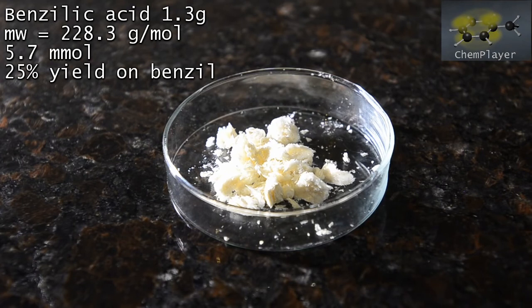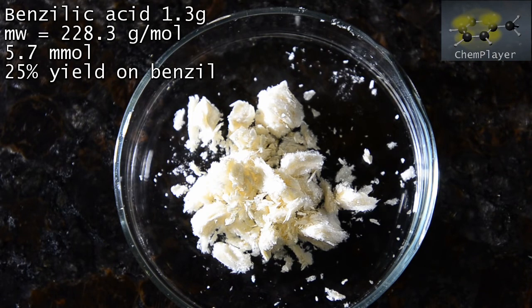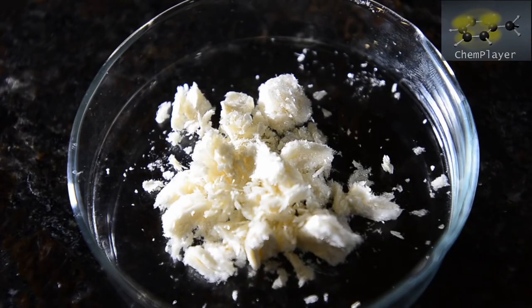The final dry weight was 1.3 grams and this corresponds to a 25% yield on our starting benzil. This isn't a great yield, so perhaps we added too much potassium hydroxide, or perhaps we boiled the mixture for too long. But it seems very pure and we're pretty happy to have isolated a nice pure product. We're not sure where we can go with this now, but we'll have a think and let you know if we find an interesting use for it.